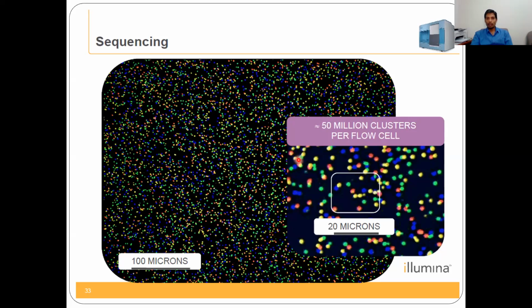See here, yellow and red. This kind of data you cannot use for the sequencing. Okay, or here. Those data will be excluded from the sequencing information. So the other sequences which are individual clusters will be taken. Maybe around 10% of the information may be of no use, based on how properly the concentration was injected.